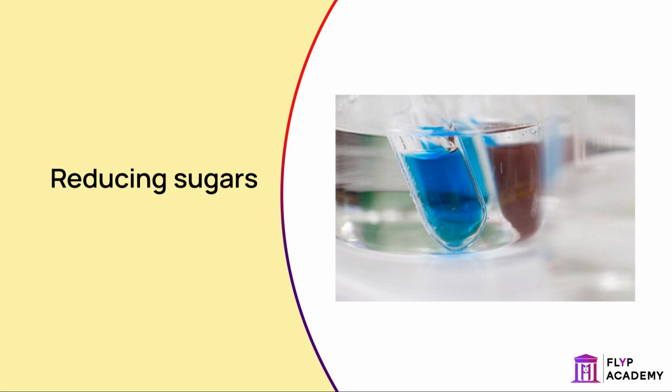Any of these colours represents a positive result for the presence of glucose. A negative result would be if the Benedict's solution remained blue. Glucose solution or sugary sweets would give a positive test for glucose using Benedict's solution.